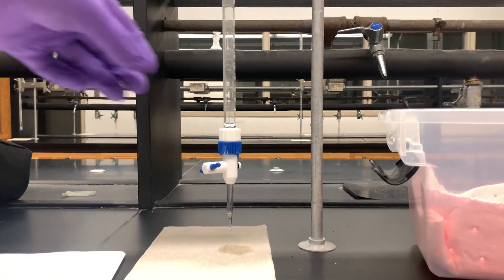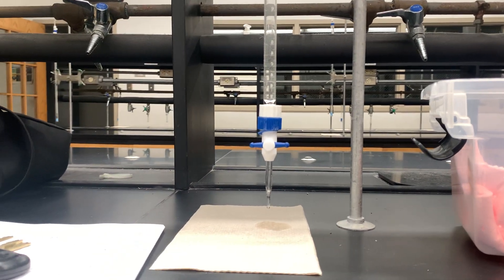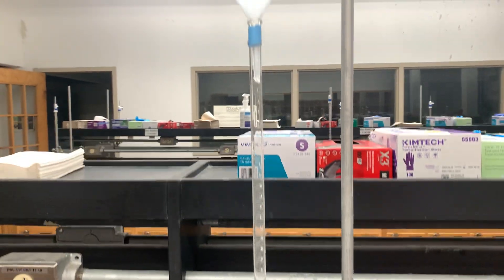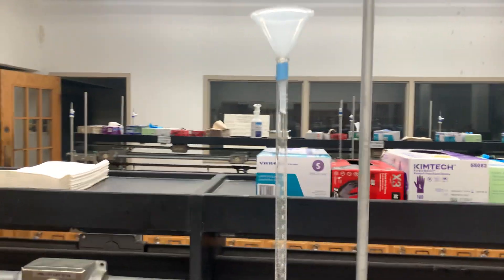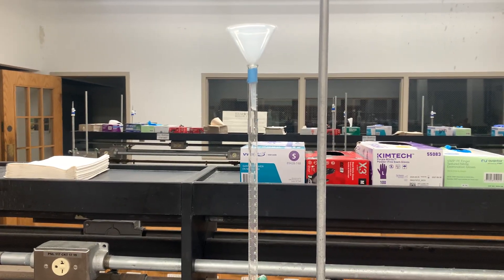Before you start adding any solution to a burette, you want to make sure that your valve is completely perpendicular with the piece of glassware itself. The next thing that you want to do is make sure that you have a funnel placed at the opening of your burette.